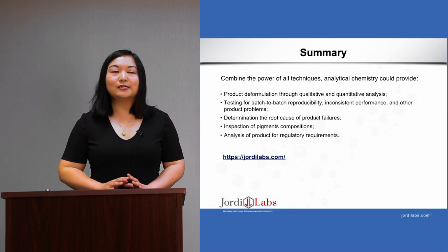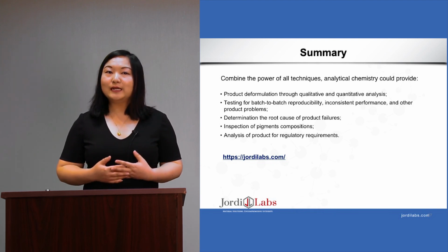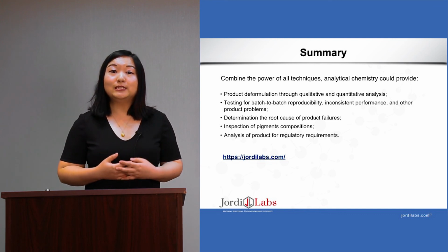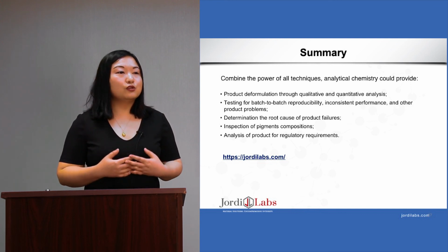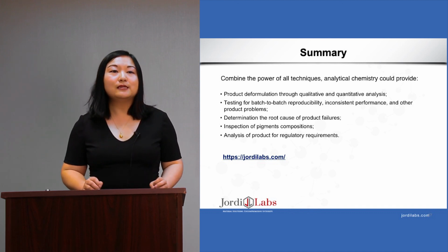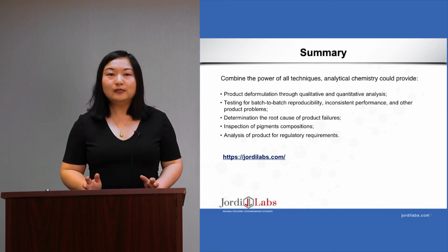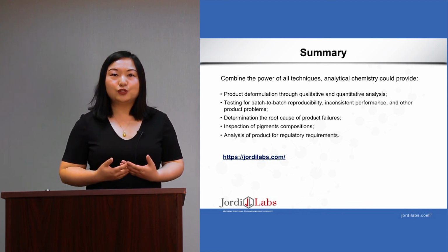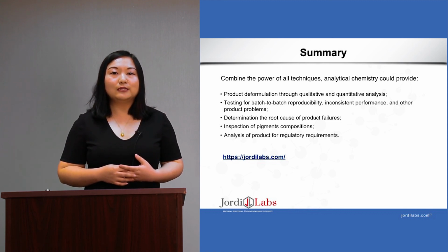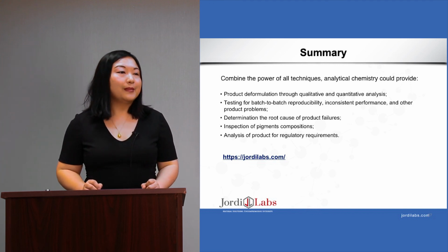Okay, so comes to our summary. In today's talk, I covered different aspects of cosmetic analysis and how we can use the up-to-date techniques to help us solve different problems. We can use LCMS, GCMS, and other spectroscopy methods for deformulation. The deformulation can allow us to look into the chemical constituents of a product, and it can also allow us to compare products to products.